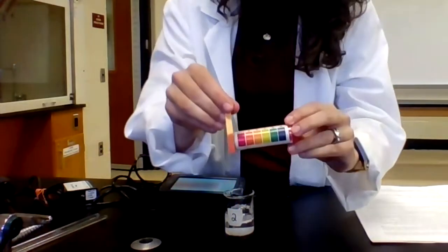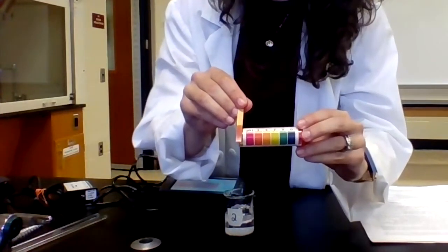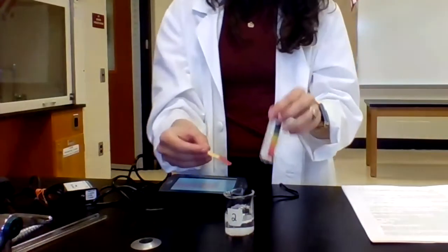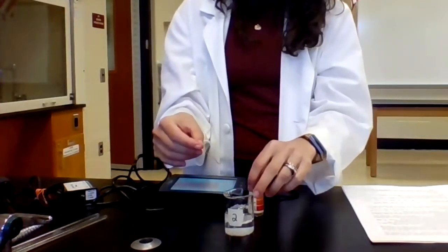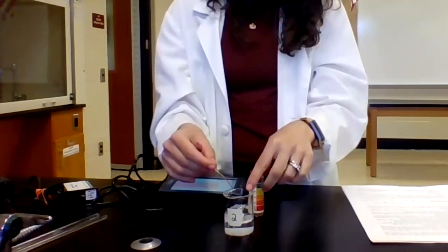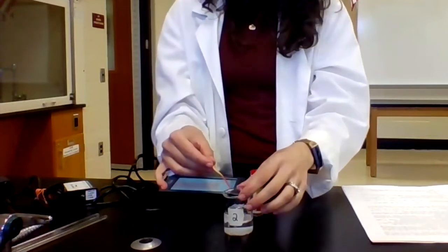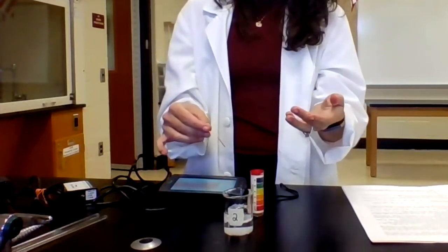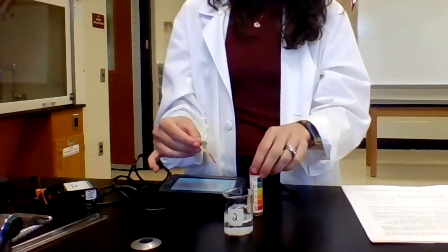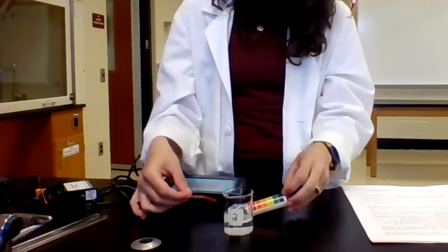And what we can see is that it turned red, indicating that this has a pH of 1. So it is certainly acidic. So it is likely that not only is this a polar covalent compound, but that it's also an acid. And that's why I had a little bit of conductivity there. It wasn't 0, because we know that acids donate their H+, and so those H+ ions are likely what was causing the conductivity to read around that 450.